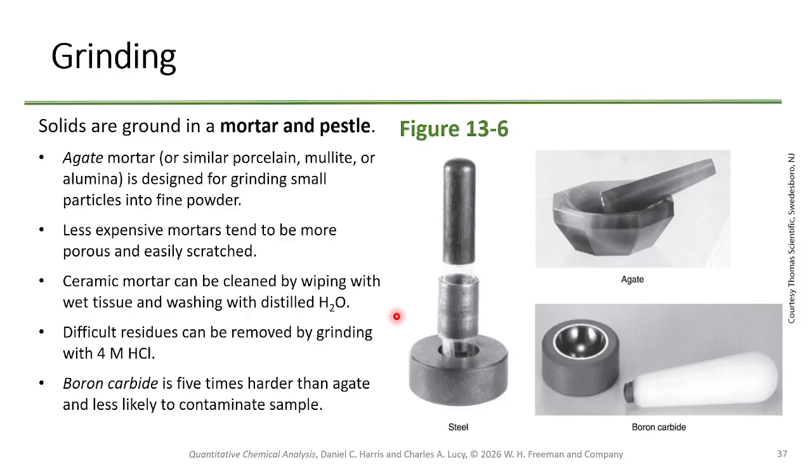Ceramic mortars can be cleaned by wiping with wet tissues and washing with distilled water. You may, however, have to use HCl acid to help you remove and break down whatever's in there.